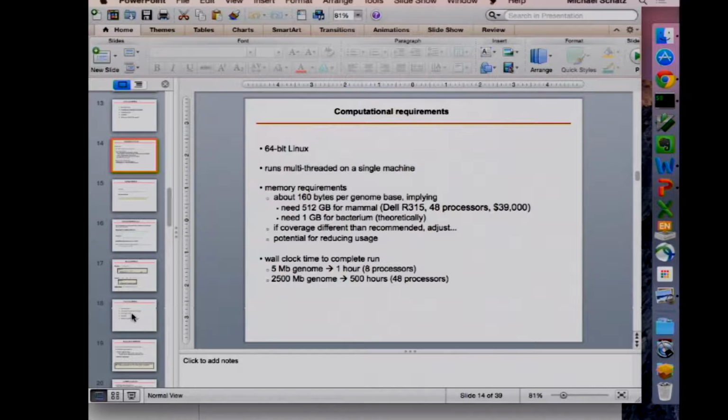In our example, it's going to take a couple minutes, a few 100 KB. For the human genome, they're saying 500 hours, perhaps 5,000 hours. The biggest genome I ever tried to assemble was a variety of wheat that was many gigabases. The biggest machine that we have at Cold Spring Harbor has 1.5 terabytes of RAM. I quickly ran that out of RAM.